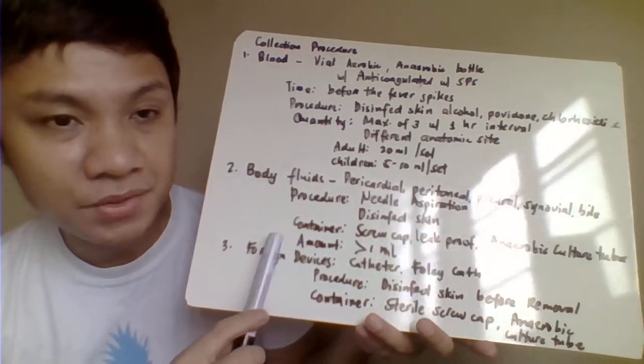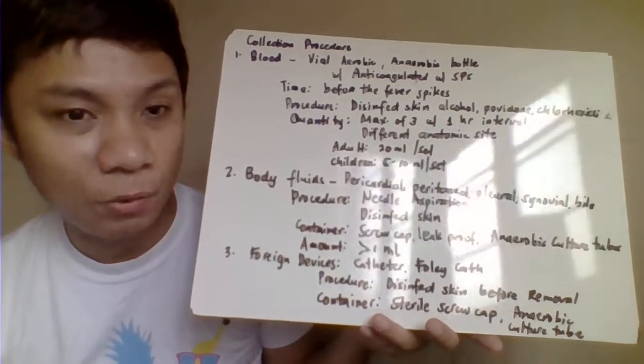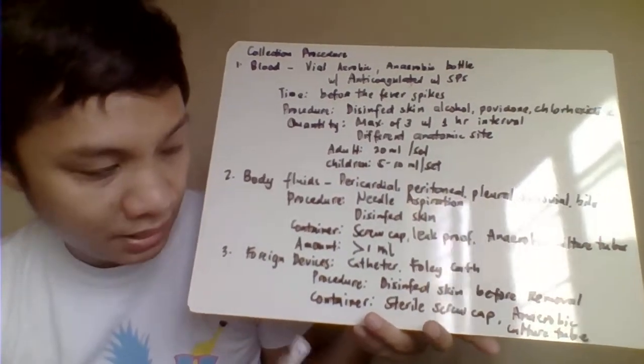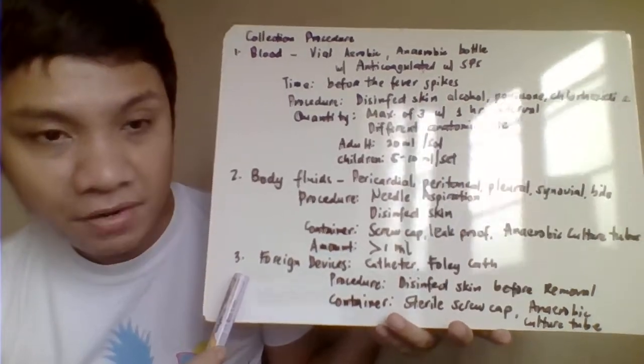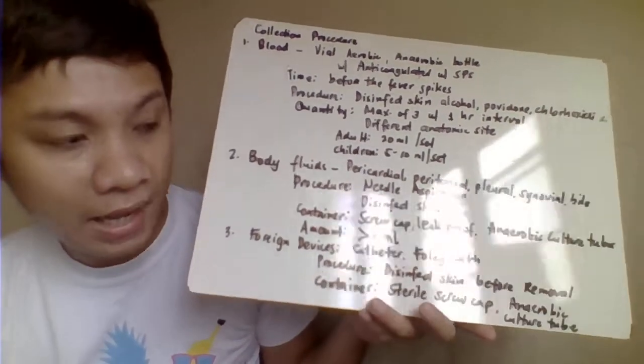How much? Approximately it should be more than 1 ml. Pag less than 1 ml, reject. Kulang. Quantity not sufficient.